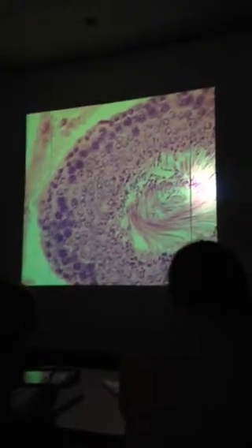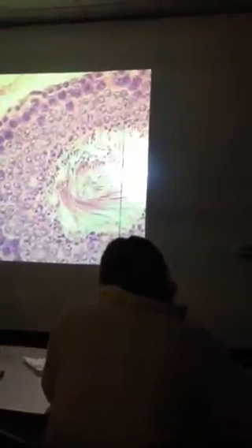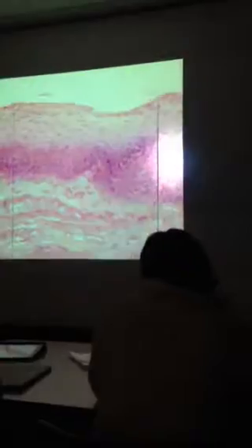If I ask you, what kind of tissue is this? You say germinal epithelium. On the ovary, the germinal epithelium is a simple cuboidal epithelium on the outside of the entire ovary. But in males, the germinal epithelium is what lines each of the seminiferous tubules.